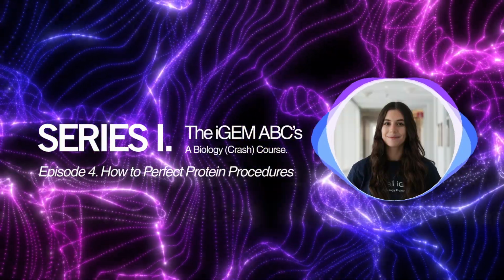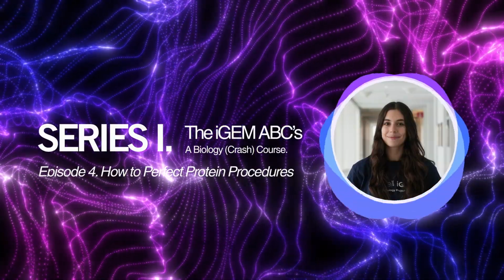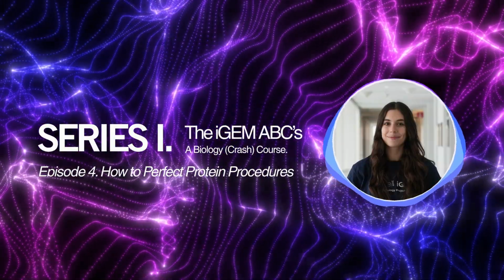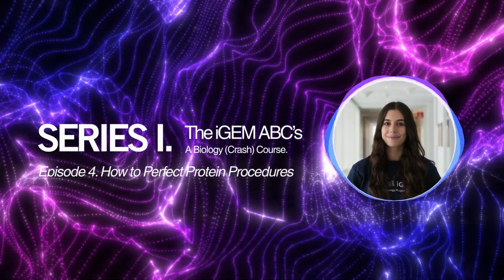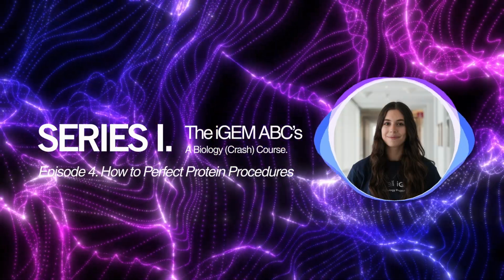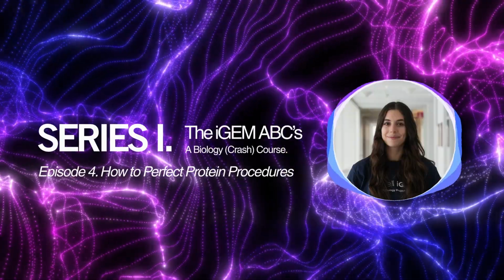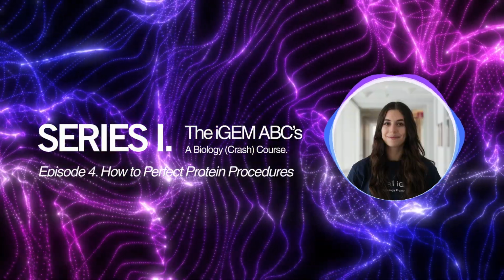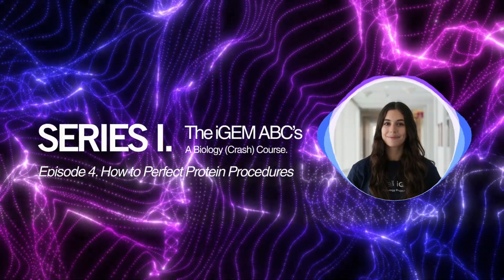Finally, we collect our protein by passing another buffer through the column called an elution buffer. And this contains a much higher concentration of imidazole. This imidazole has a high affinity for transition metals again, and since it's present at such a high concentration, it'll displace our protein, allowing it to flow through in a process called elution. And sometimes you'll find that your buffer isn't strong enough to elute your protein fully. That's when you'll scale up your imidazole concentration to allow that molecule to successfully kick off all your protein.